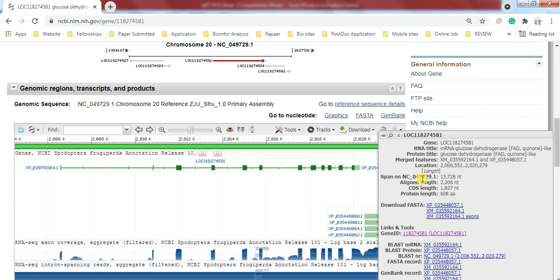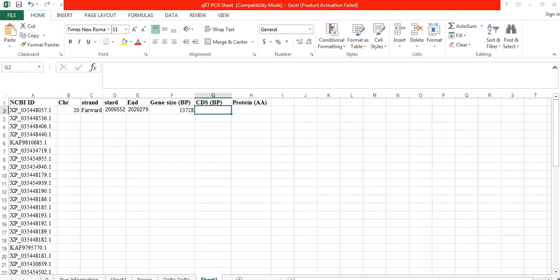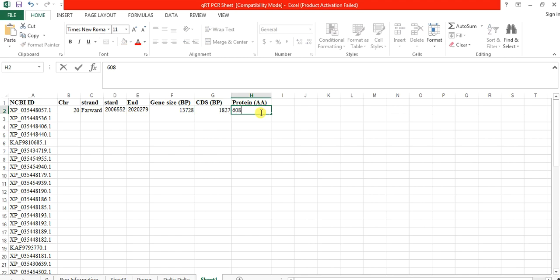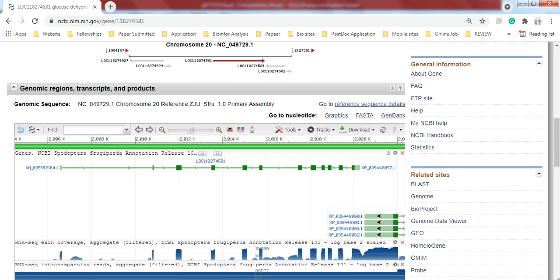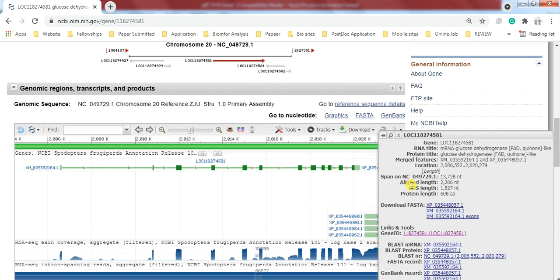And this is the CDS length 1,827 and protein 608 amino acids. 1,827 and 608. And you can also download these sequences.